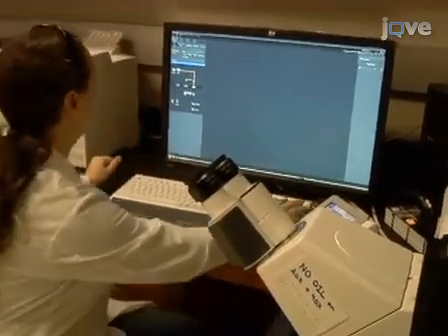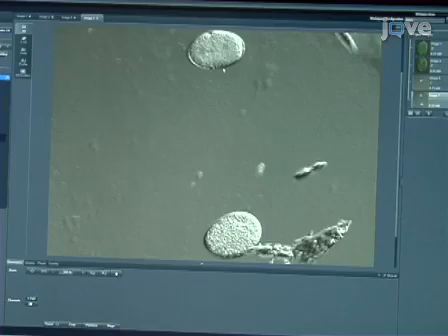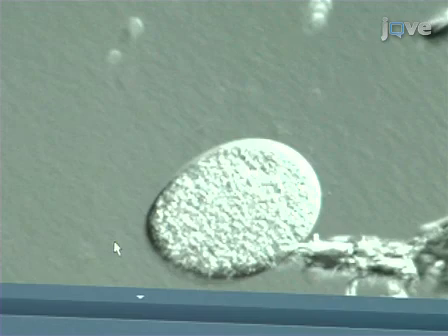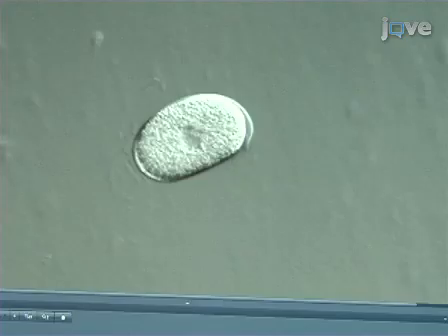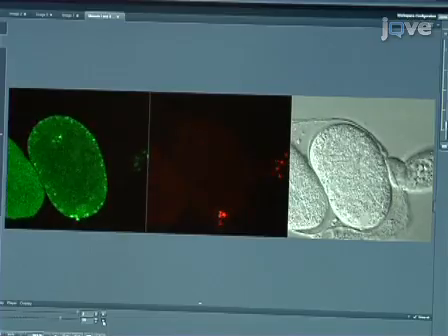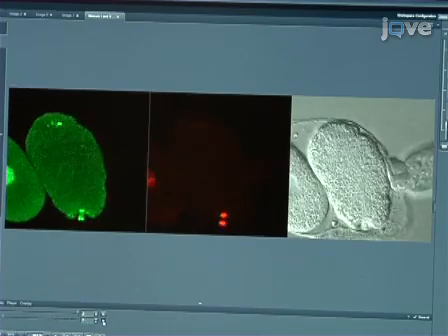Now begin imaging by locating embryos under the 10x objective. To find early-stage embryos, search for embryos that are in the process of completing maternal meiosis. Meiotic embryos can be distinguished from later embryos because they have not undergone shortening. After completing meiosis, there is a significant gap between the cell membrane and the eggshell at the anterior end of the embryo. Once an appropriately staged embryo is identified, move to a higher magnification lens for recording of embryogenesis.